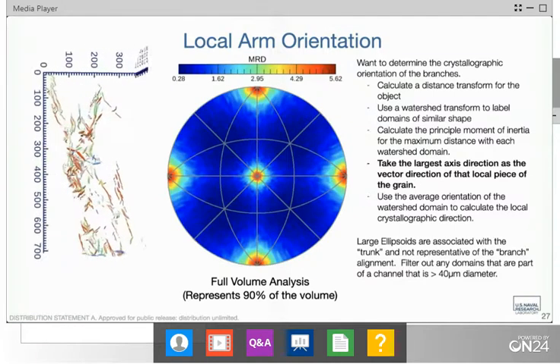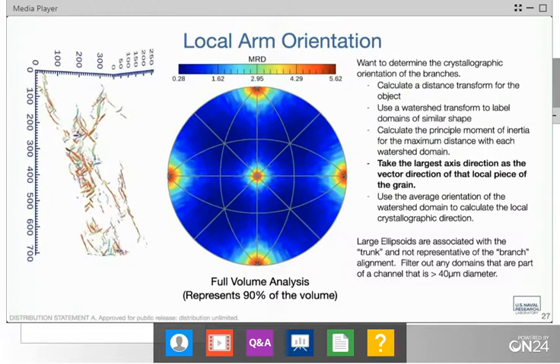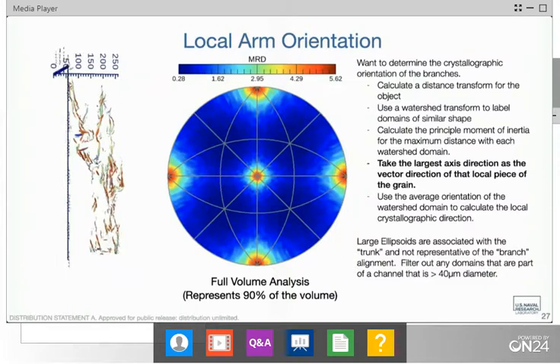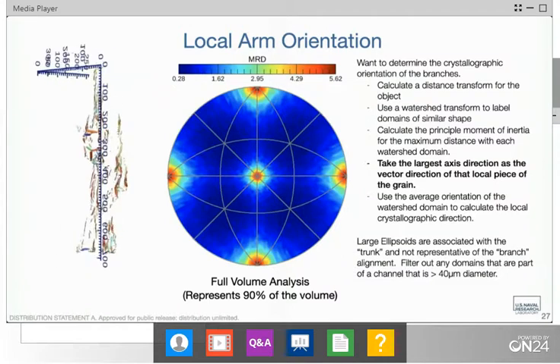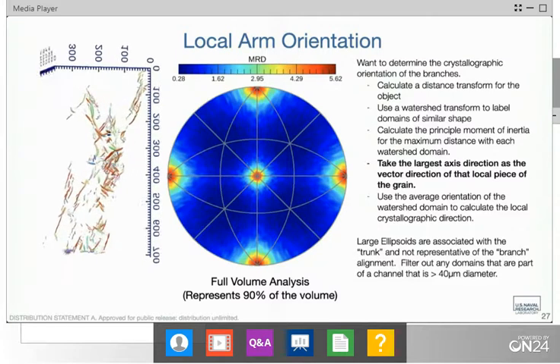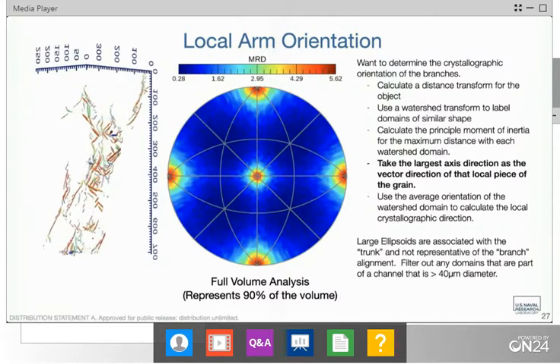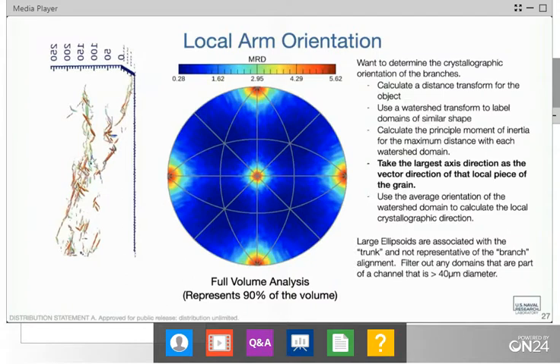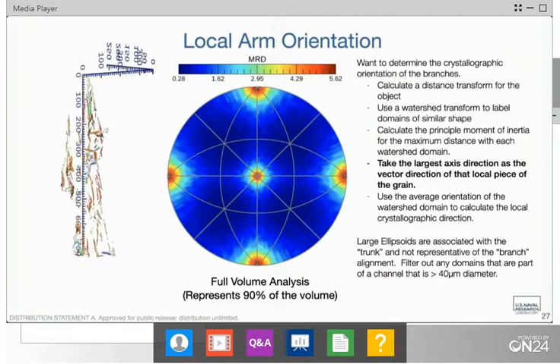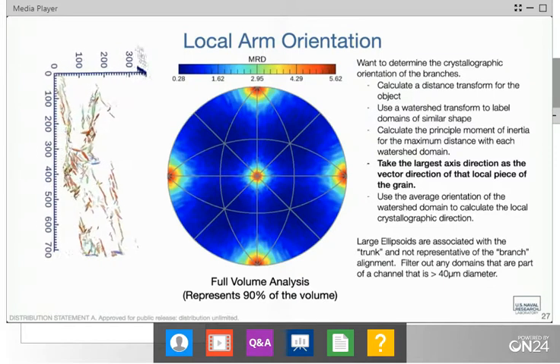In terms of the difference between lath martensite, bainite, and acicular ferrite, those are things that we've been investigating at NRL through the years. We find it tends to be very alloy dependent, and there are some things we've discovered for very low carbon alloys that make some sense in terms of pattern quality.